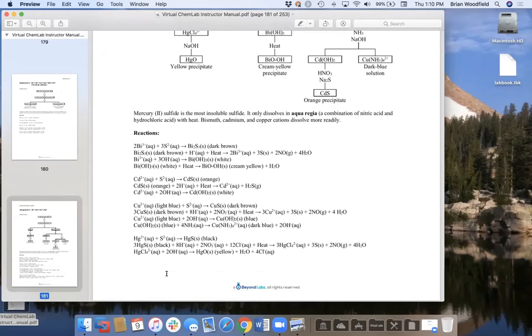Hi. At the start, you mentioned that we could get Word versions of the worksheets. How do we go about doing that if we're interested in that? Just ask me. I'll send all of that. Just have Nala send me an email, and I'll send it all to her, and then she can distribute to everybody. I mean, to us, the worksheets are useless without the software. So we don't care about the worksheets.